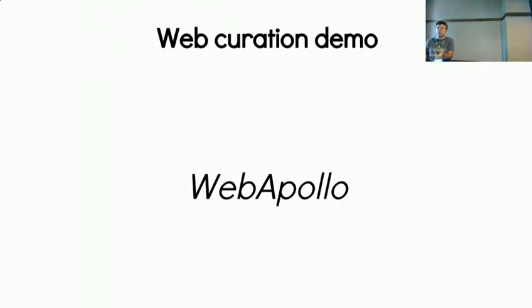I think there's additional functionality that needs to go in there. I think the biggest one is, you guys can correct me if I'm wrong, you only get canvas tracks when you import data as opposed to HTML tracks in JBrowse. As in canvas, you can't click and drag them up. Sorry, this is going a little esoteric, but when you actually drag these up, there's a certain type of track.